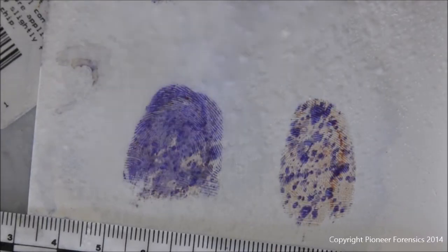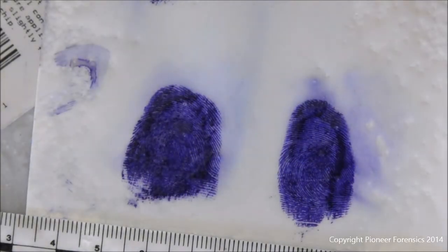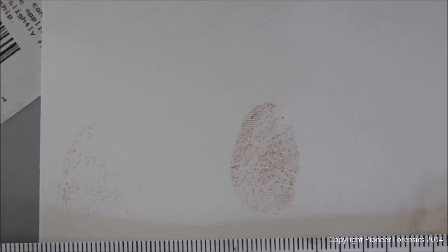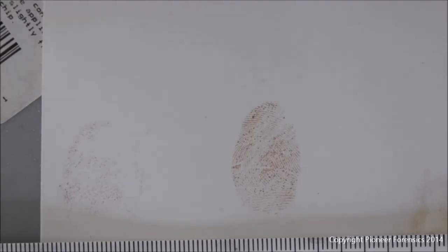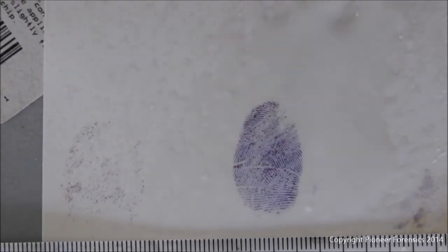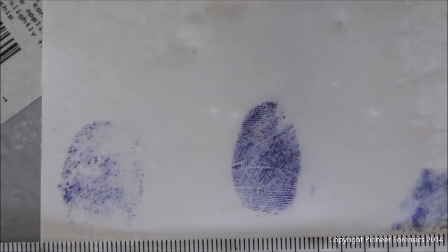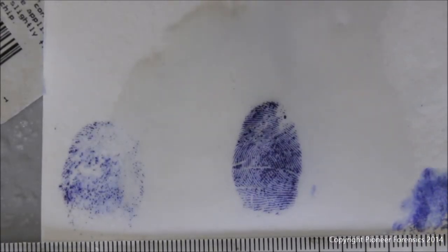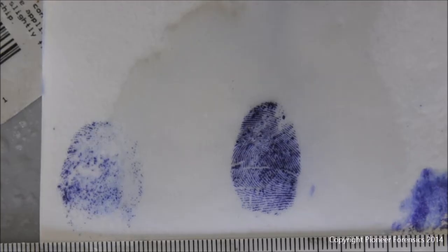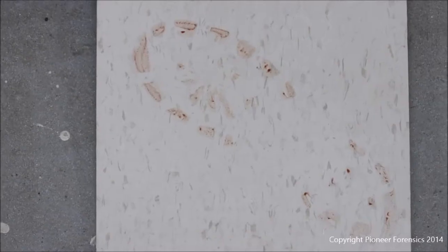Welcome to the Pioneer Forensics channel. In this video we're going to look at the use and application of Leukocrystal Violet. Leukocrystal Violet is a blood reagent suitable for both laboratory work and examinations, and probably its best use is applications at the crime scene or in the field.